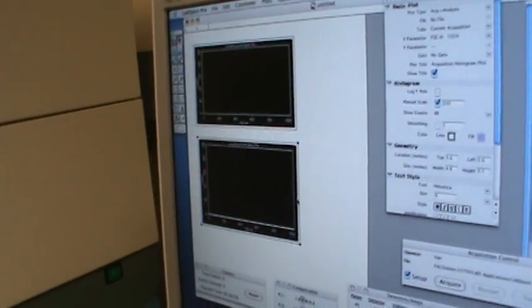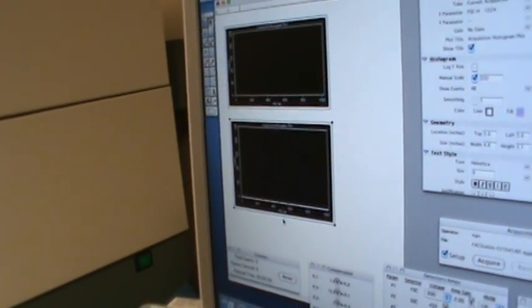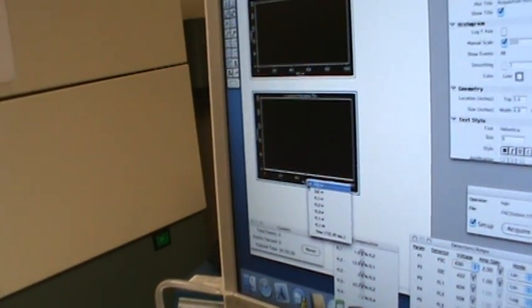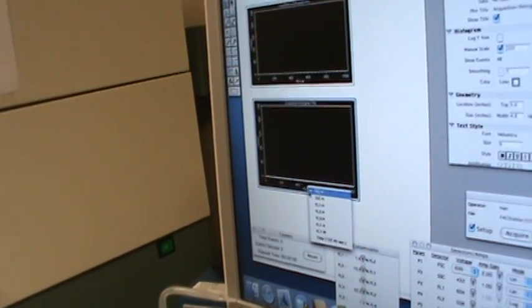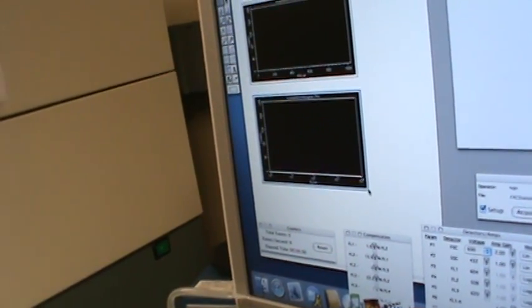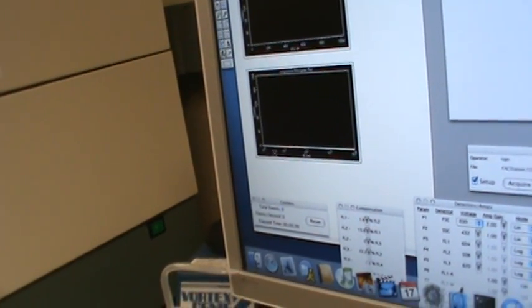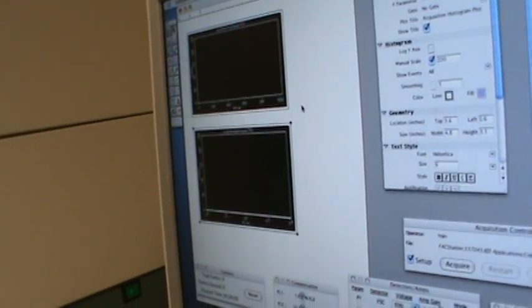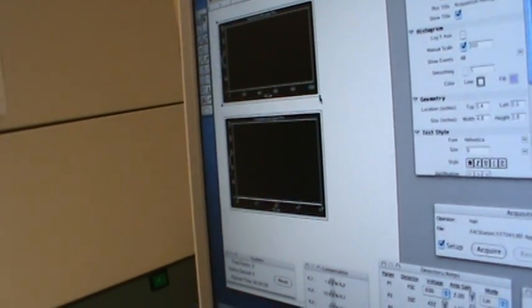Now you have to decide what type of plot. What are we looking at? What is your x-axis? So if you are looking at FACS, you'll be looking at FL1. Okay. You see it's a log scale. When it's log scale, is the data also saved in log scale? I can't remember. Sometimes it's saved as linear, but I can't remember. Okay. That's a good question.